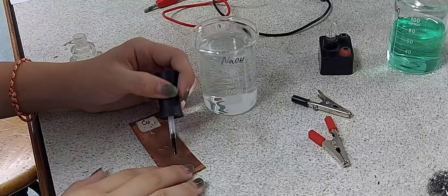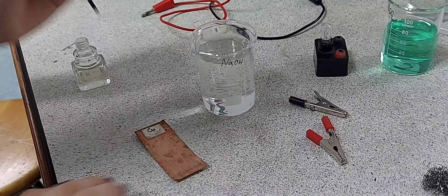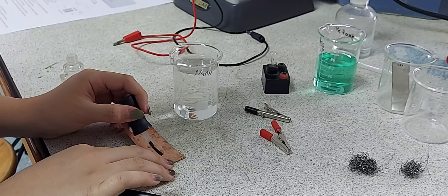Here my student is drawing a picture of her choice on the copper electrode using nail varnish.